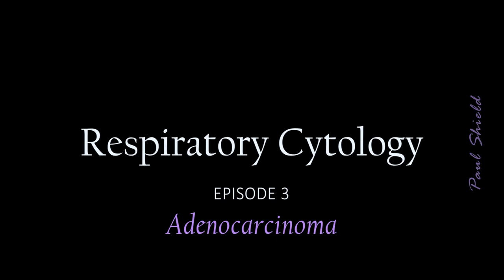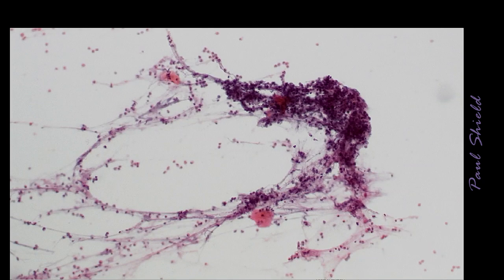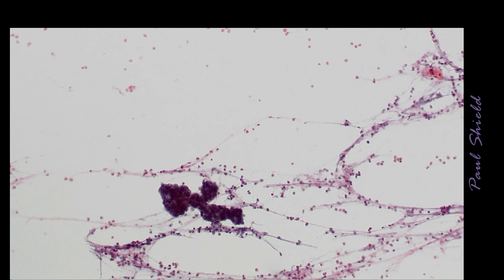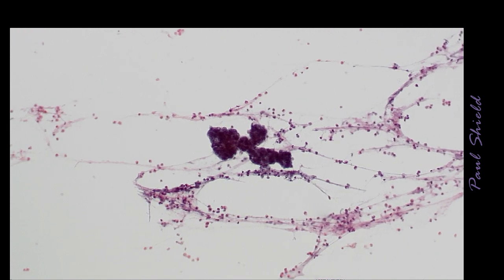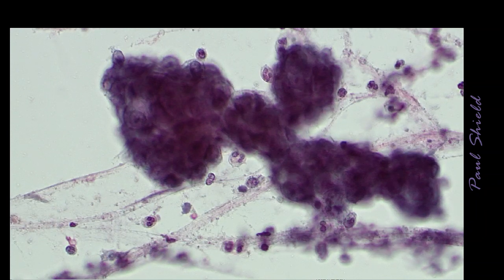Hi, it's Paul. Let's look at adenocarcinoma in respiratory specimens. We'll start with sputum. And the classic appearance in sputum is balls of cells that are hyperchromatic. This is a classic example here. You can see the grouping has three-dimensionality to it.